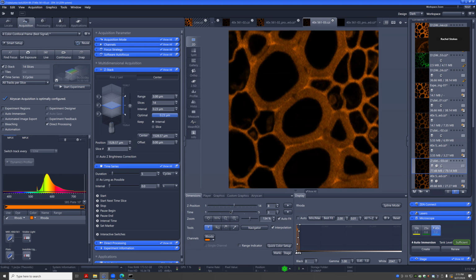So even while the time lapse is going, when you hit the little update button, you can see, oh, my first 3 time points look good, right? Or, oh, it looks like things are starting to drift out of focus. Let's stop, right? So that's what you can do here in that raw file. It'll give you an idea of the signal.